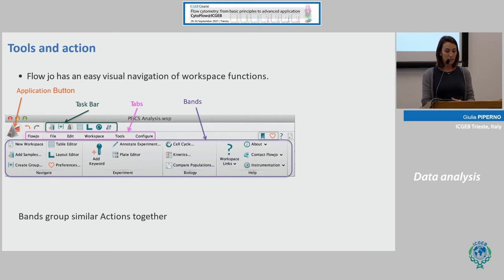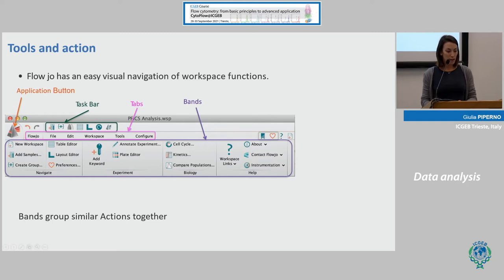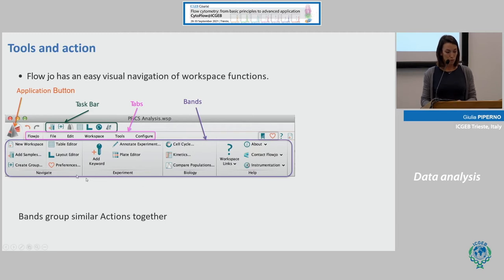FlowJo has an easy visual navigation of workspace functions. There is an application button where you can save, open, or edit a workspace. There is also a taskbar with actions you can perform, like inserting a sample or going to the Layout Editor and Table Editor. It is also divided into tabs and bands — bands are important because they group similar actions together, so you can navigate your experiment biology like cell cycle kinetics.